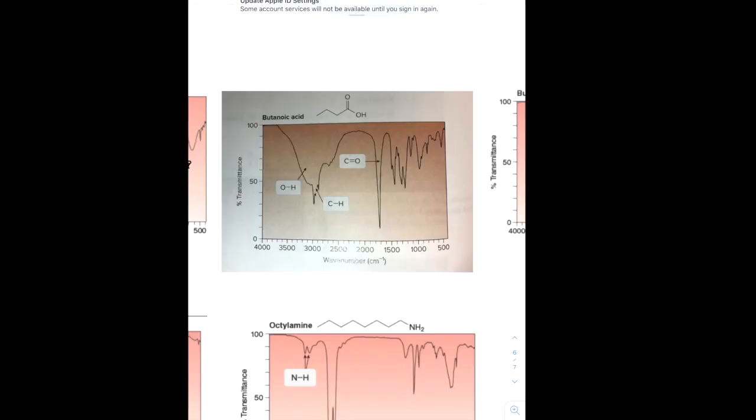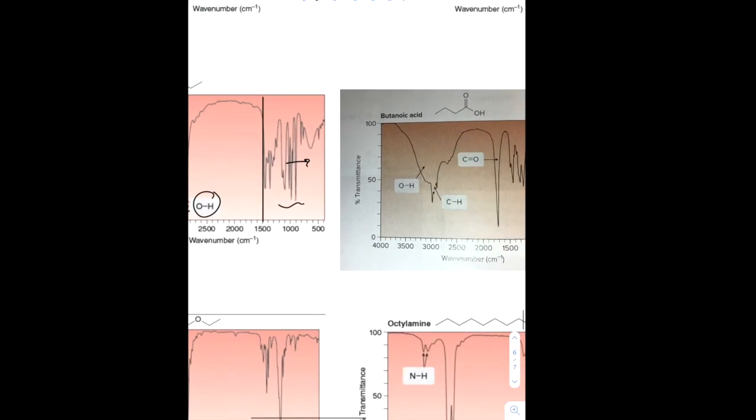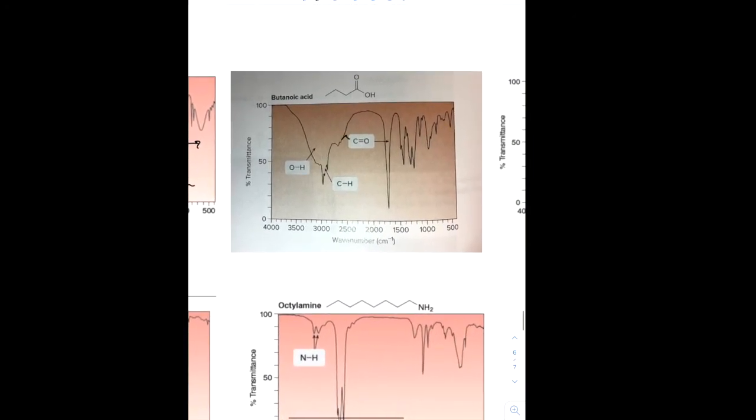All right, so here's the example of the carboxylic acid. As you can see, the range is much more drastic. This kind of died out around 3600. This goes even maybe a little bit further over here, and then definitely over to this range as well.